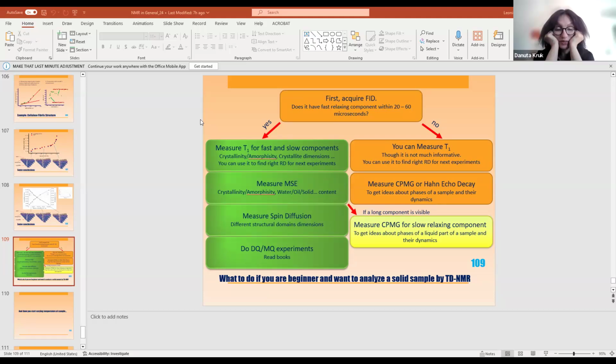Yeah, so let's understand it in terms of exchange processes. If the exchange occurs on a time scale much shorter than T1, then you have a kind of average effect. But as I said, this happens for heteronuclear systems, for which there's no exchange, because the system itself is very simple.